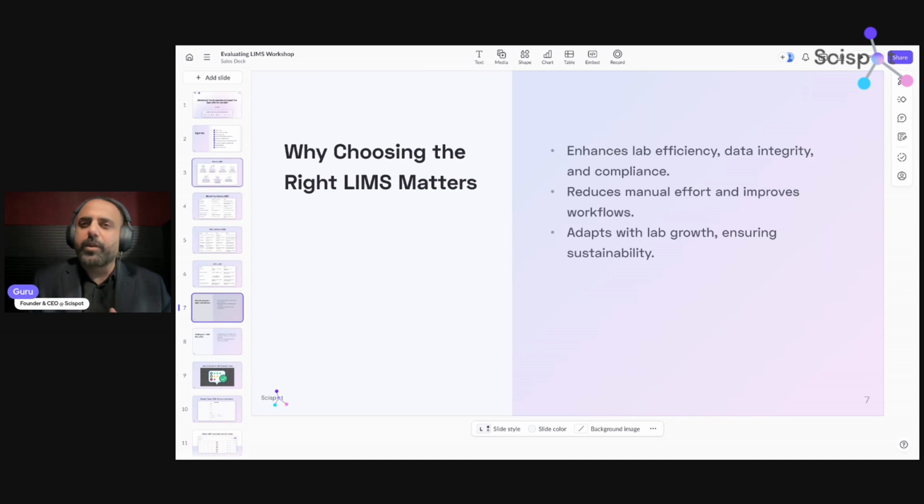It's really painful for them because they are comfortable with very rigid workflows, and familiarity always gives a cozy feeling. So migration is very painful and also expensive because many traditional LIMS have data locked in. Most of the data in the right format is also not exposed through API endpoints. So migration becomes a challenge.